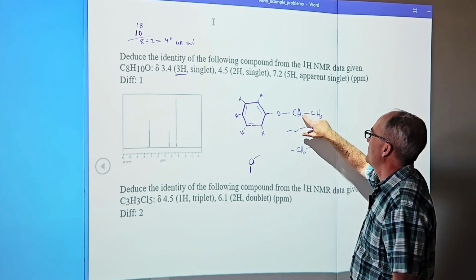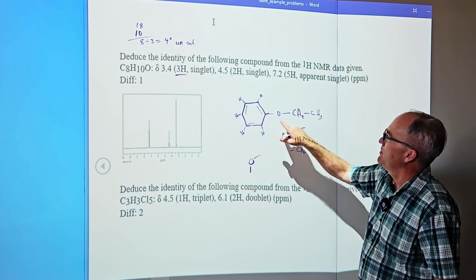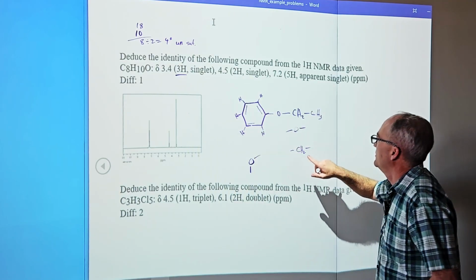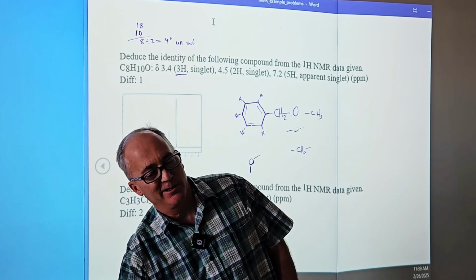All right. Now I saw one of you shaking your head. Triplet, quartet, singlet. I don't see that. I see singlet and singlet. We wanted this thing by itself, and we needed the C2 by itself. Now how's that looking at us?